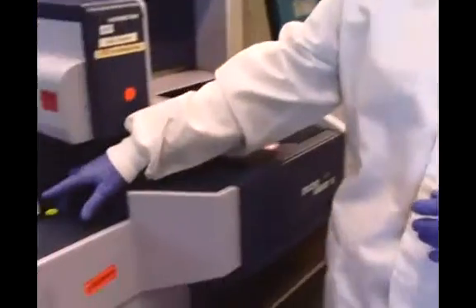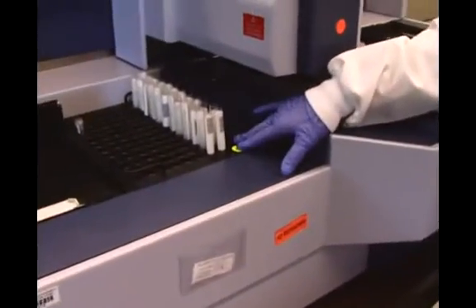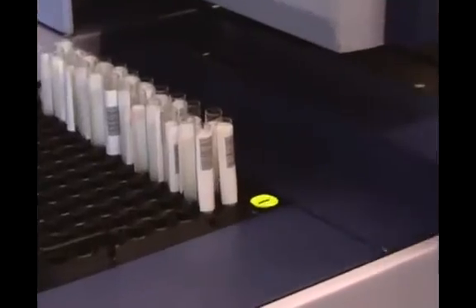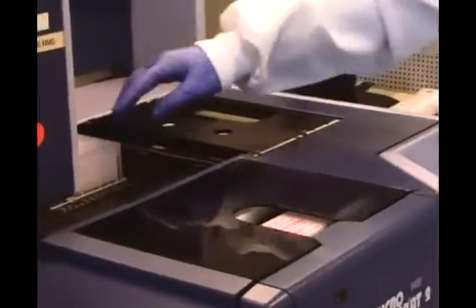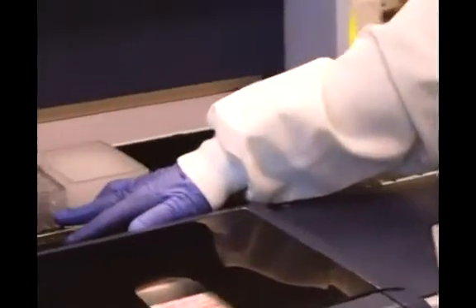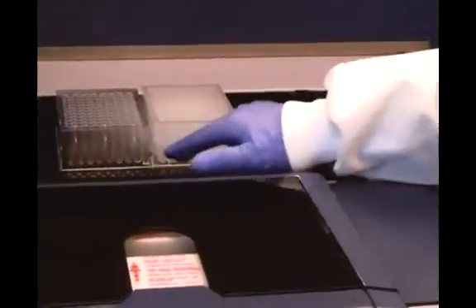So the donor samples, again, have the unique barcodes on them. They're loaded onto the pipetter, and the pipetter is going to take several swings, and it's going to actually pipette the plasma into two plates.